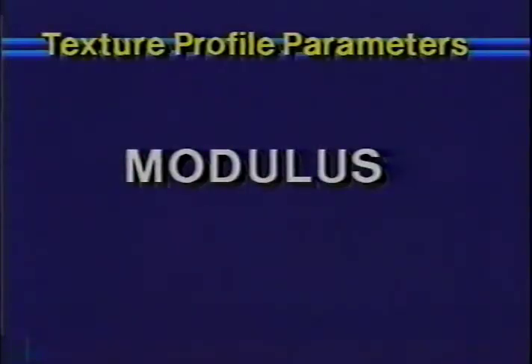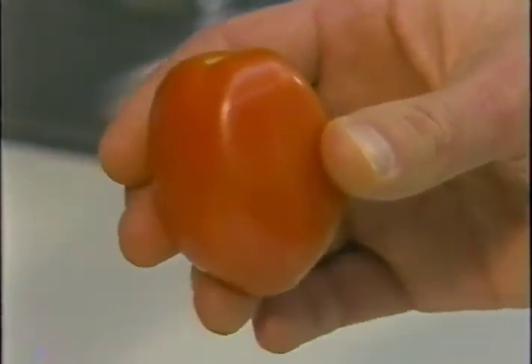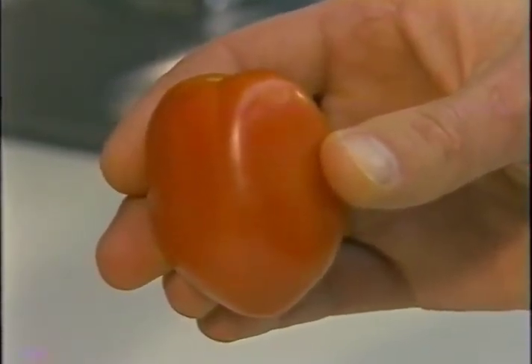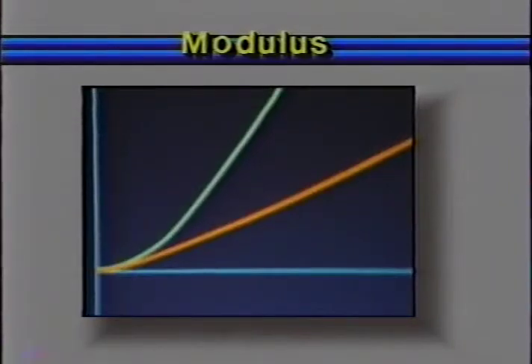First, the modulus, or more completely, the modulus of elasticity. Modulus is the strength of the material in the linear viscoelastic region. We all do modulus evaluation when we buy produce. To tell if a tomato is ripe, we squeeze it, just slightly, not enough to do damage. So it is with gels. Modulus tells us how firm the gel is when compressed, before it causes any significant breakage. The measurement is expressed in force per unit area and is defined as the slope of the stress-strain curve in this region.